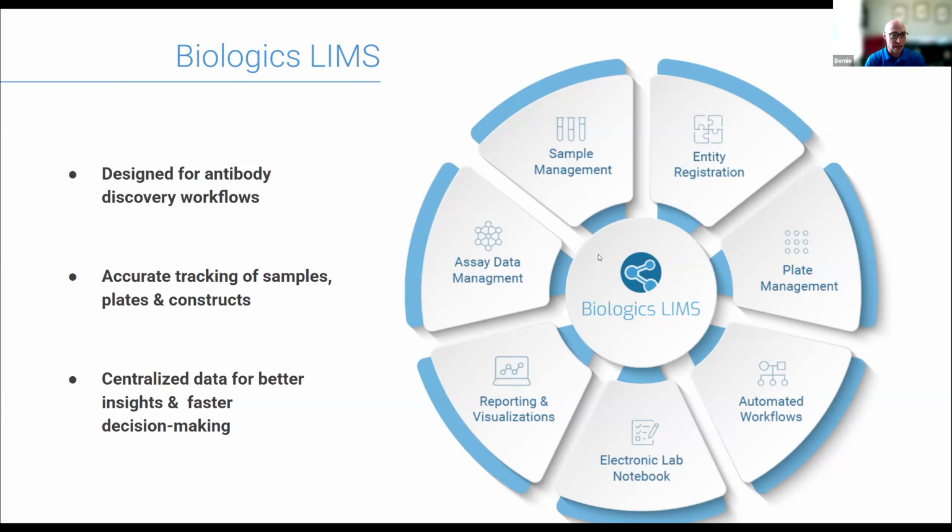Those tools facilitate accurate tracking of samples, as well as the plates in which you will probably primarily be operating, as well as giving you a centralized place for all of this data that's consistent and allows for finding your data faster, quicker insights, faster decision making, stuff like that.